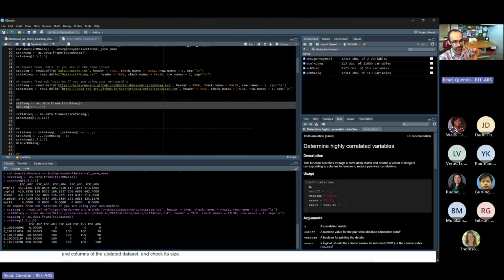But the methylation is actually a different structure than the RNA-seq. It is actually a percentage between 0 and 100. The bisulfite sequencing method detects methylation as a continuous variable. Like 0, it's completely unmethylated, and 100 is completely methylated. So many of the numbers are either 0 or 100, but you can see there's also 30 and 90. There's some that are in between as well.